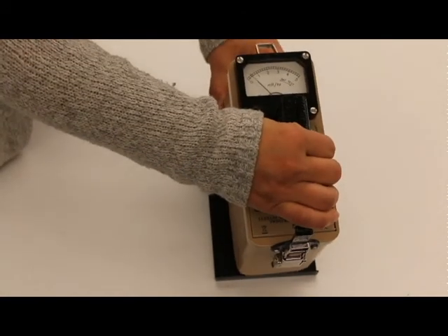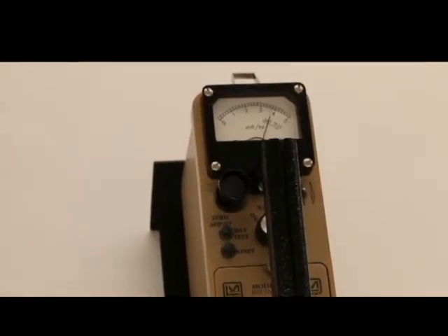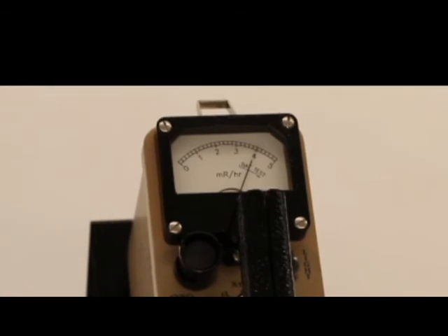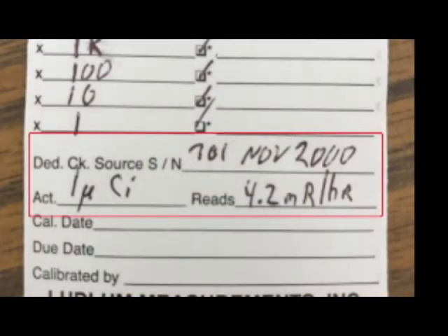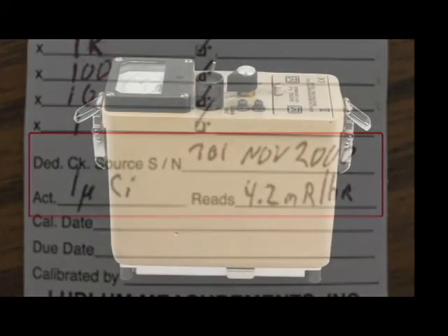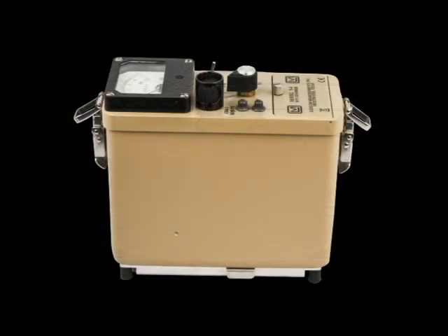Expose the check source to the center of the chamber window. The instrument should read plus or minus 20% of the recorded reference reading. If the instrument fails to read within 20% of the reference reading, you should check the condition of the desiccant. If the desiccant is okay, then the meter should be taken out of service and/or sent to a calibration facility for recalibration.